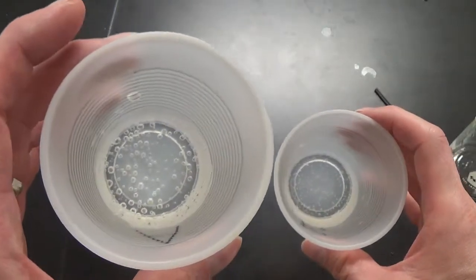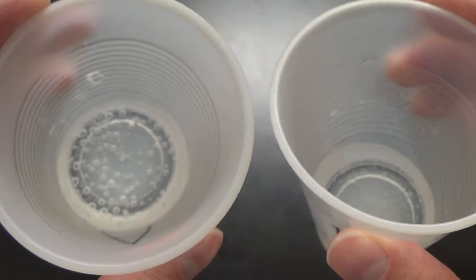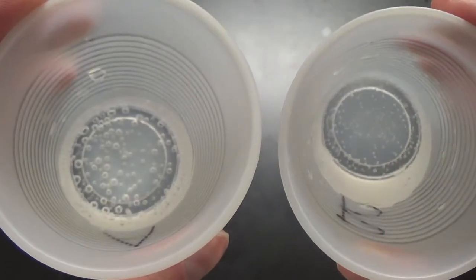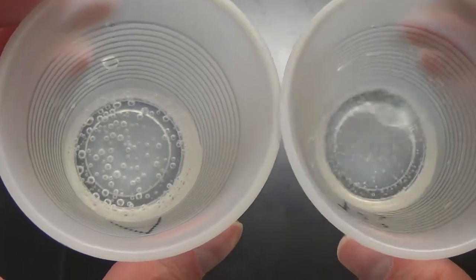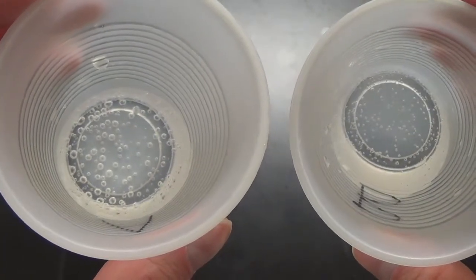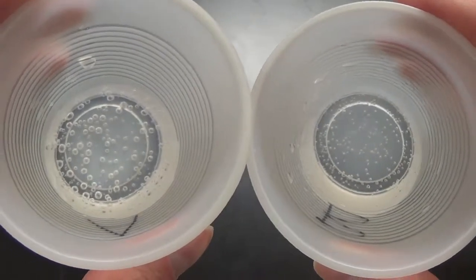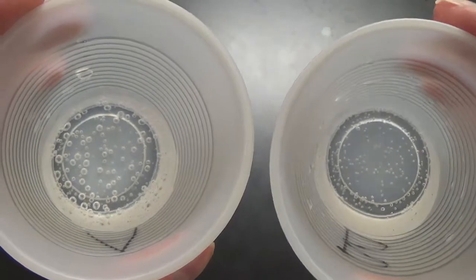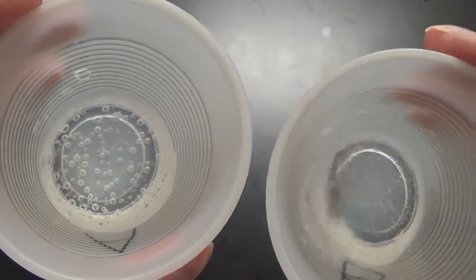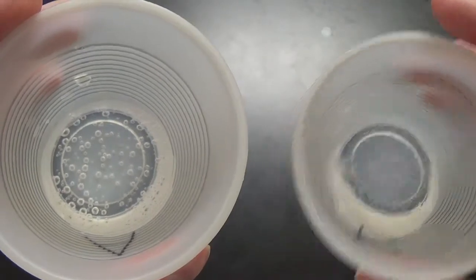So this was my control, and this is the one I stirred. And I thought originally I stirred it until the bubbles were gone. Clearly there's a few bubbles left, but definitely got rid of the bubbles in stirring. That's undissolving the gas. I would not want to stir to dissolve the gas. That would be bad. But stirring undissolves the gas, and so that's what we learned in lab.